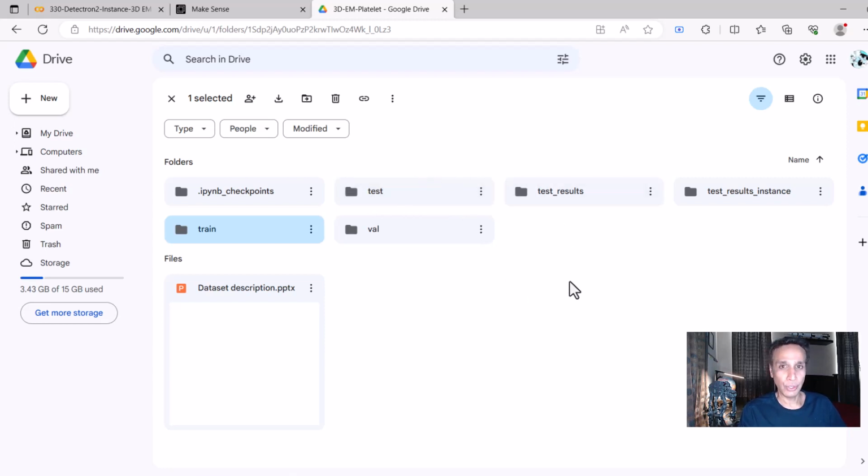I will also show you how to save not just these bounding box images and colorful images, but actually results for scientific image purposes. What is the reason you're doing this? Because you want to, for example, do some downstream analysis, put all these images back together into some sort of a 3D format and then extract certain metrics. I'm just thinking out loud. But whatever it is, you may want your results to be in instance format, meaning you want a binary image only for cells, another binary image only for mitochondria, and so on. So if you want to import this into, I don't know, ImageJ, for example, then that's the placeholder. I'll show you how to do that.